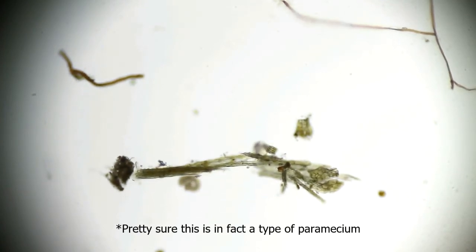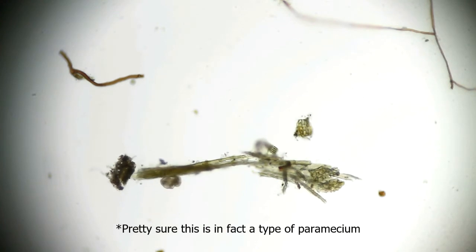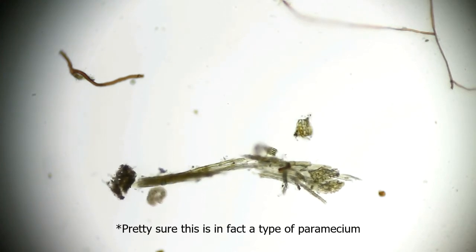Normally the stuff around this side that's kind of zooming around are paramecium, but I don't know what this is. It looks different from other paramecia that I've seen. It could be one, but very unusual, so interesting.